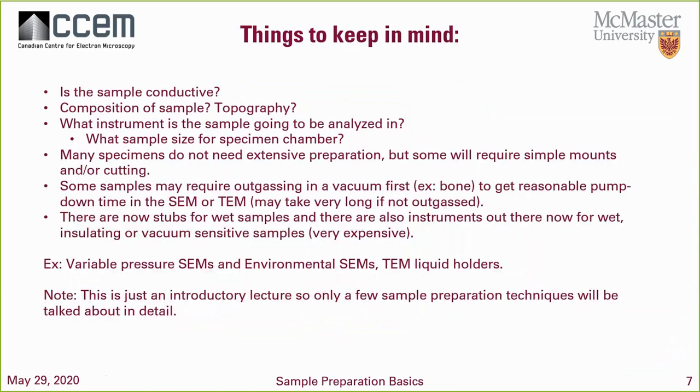Things to keep in mind as well when you're asking about the sample origin, and I already mentioned some of these points before. Is the sample conductive? Am I going to need to add a conductive layer? If it's a metal, you might be able to live with a little bit of charging if you have it mounted on a plastic or Bakelite or some sort of other mount that is not conductive.